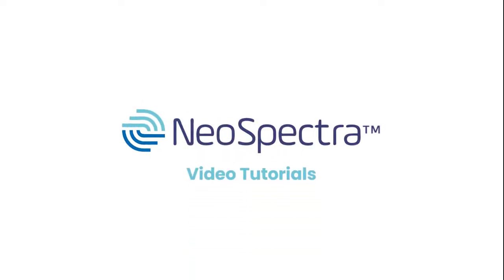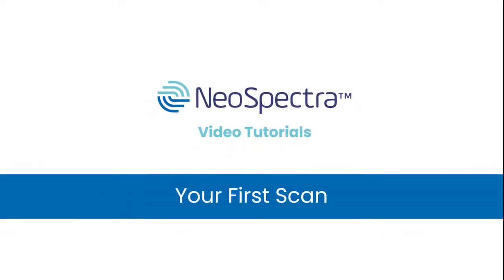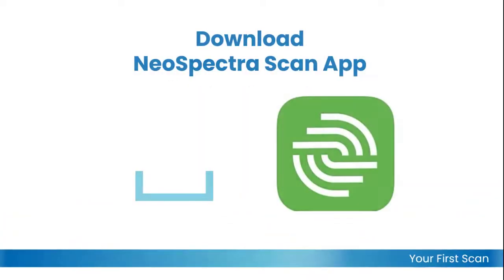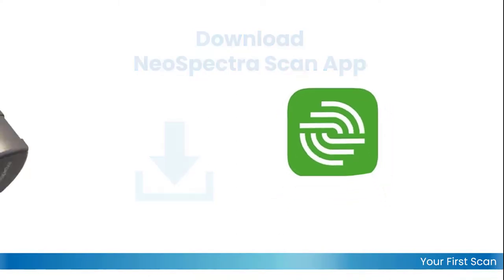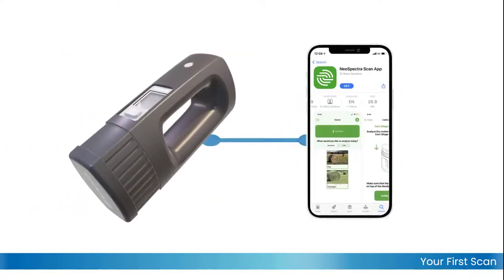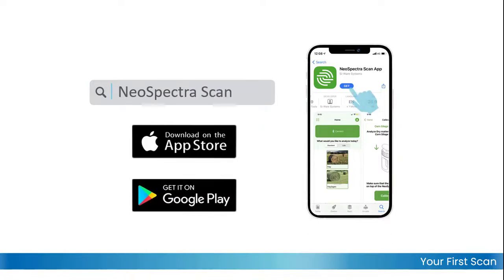Welcome! In this video, we'll show you how to use your scanner and the NeoSpectra Scan mobile app software to analyze samples. To ensure that you are ready to begin using your scanner, you'll need to have the NeoSpectra Scan application downloaded to your mobile device. This application runs the software that will enable your scanner to function.